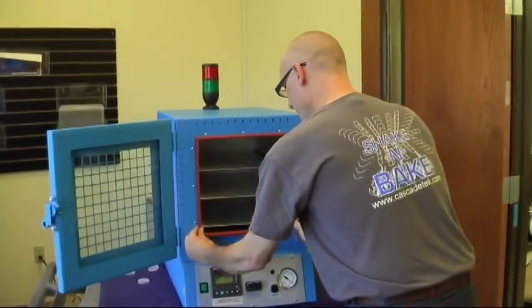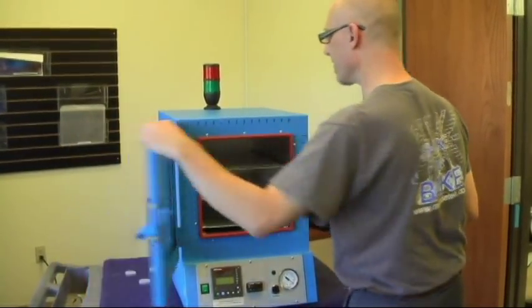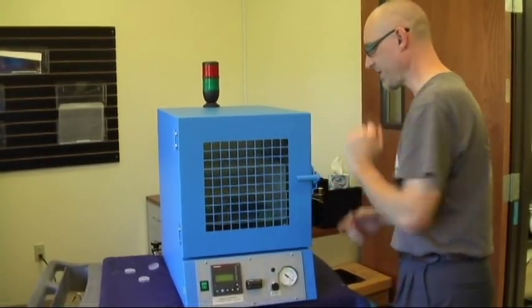Always make sure that your seal is fully installed.